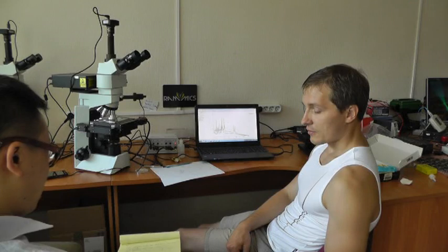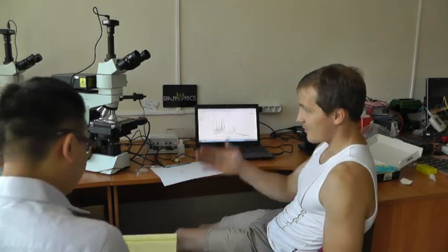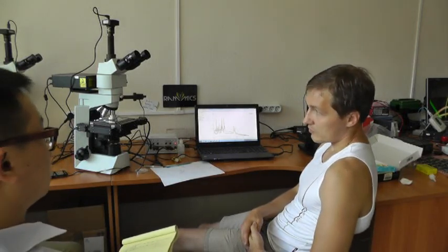Maybe 1 or 2. But why are you asking this question? It doesn't make sense if you want to cover a reasonable area with particles distribution. Normally it covers 1 by 1 millimeter for a time like half an hour.